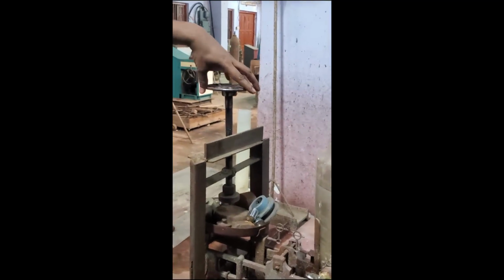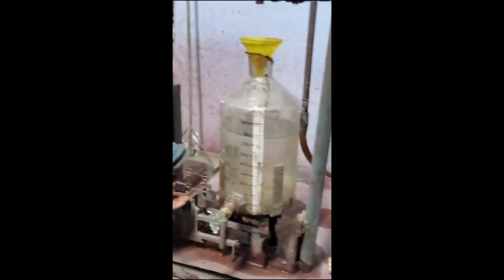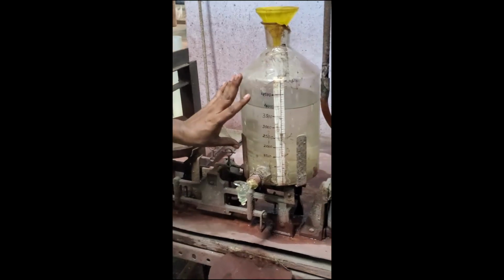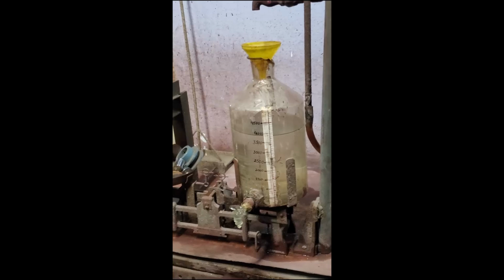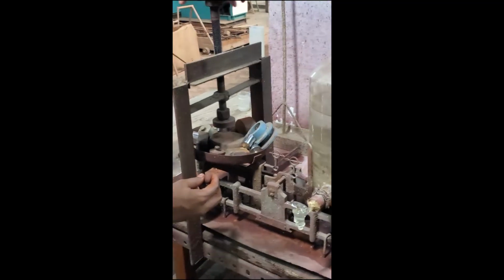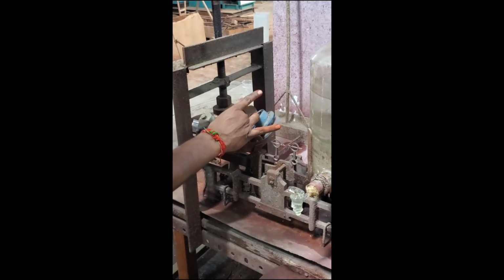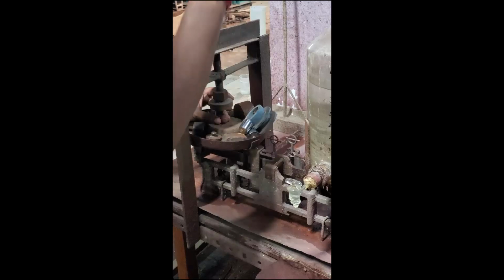So this is the pan balance. You can see left and right pan are there. On the left side we are putting the weight and on the right side we have a measured jar. In this we have filled water. We can place the pellet on this base, and here you can place down this, so we have to keep the pellet between this base. This is like an anvil.